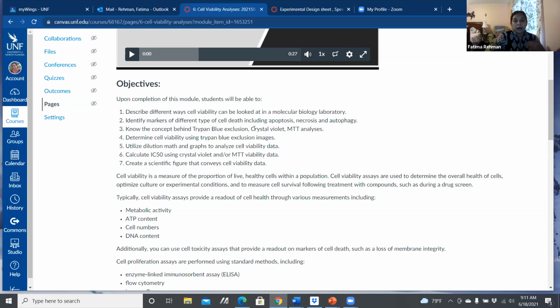And then we can observe them under the microscope, but more importantly, we can resolubilize this dye back and we can look at the response of the cell culture over time. If you had the cells grow over time, you would expect to see more and more blue in that resolubilized reagent. If your cells died over time, you would see less and less blue in that case. So this is going to show, the more blue is there, the more cells are there.